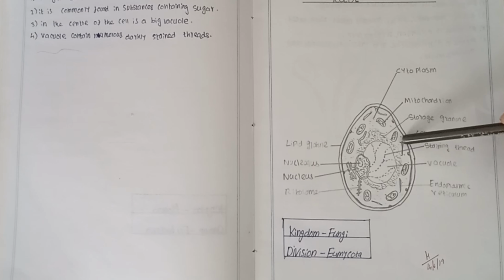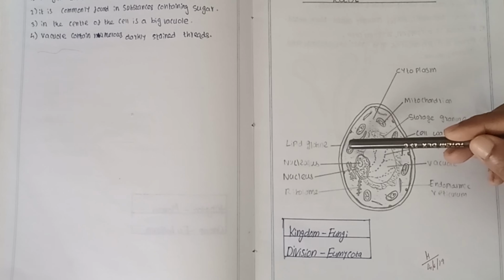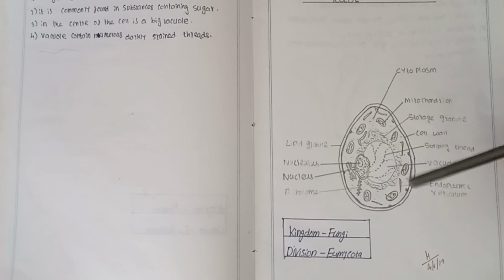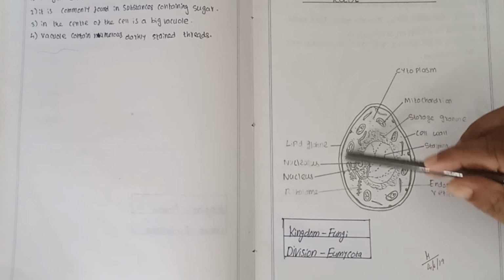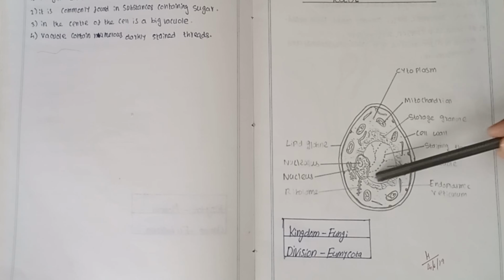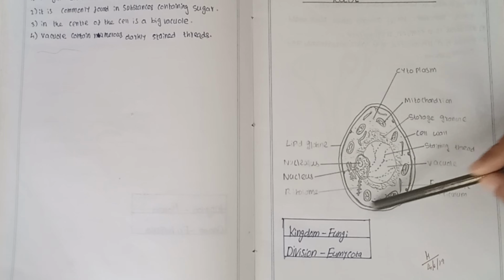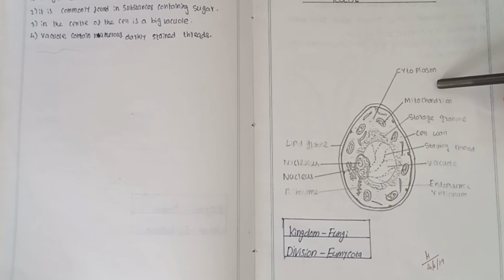Here we can see the cell wall, mitochondria and different types of cell organelles, cytoplasm, lipid granules as storage food material, nucleolus, nucleus, and a definite nuclear membrane. So they are included in eukaryotes. Yeast is a member of fungi. It is a unicellular member of kingdom fungi.